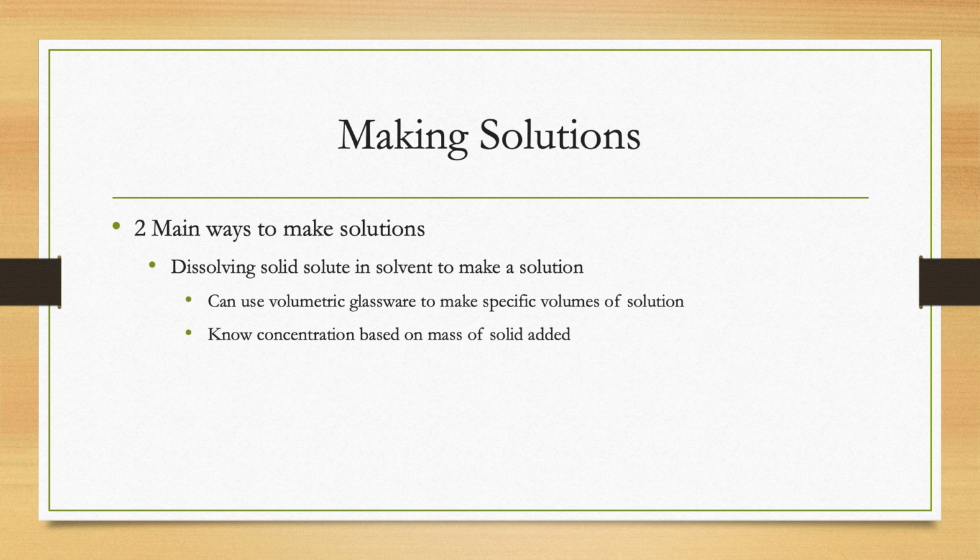But that's probably one of the most common ways to make them, because you can make solutions of a specific concentration this way by doing the calculation in advance, knowing I need to dissolve this much of a compound, mass-wise, in this volume of a solution. Or, like I said, there are other ways you could do that too. If you just know the mass and the volume that you use, you can calculate what the concentration is if it's not important to have a certain concentration.